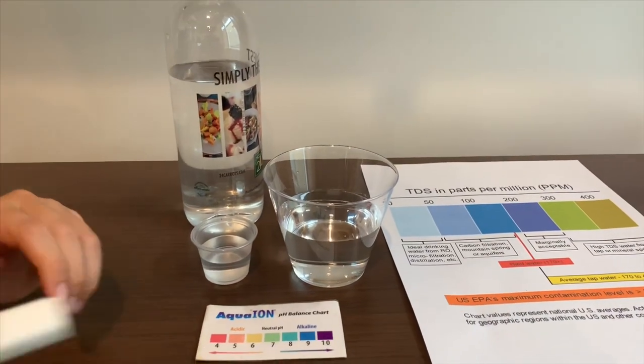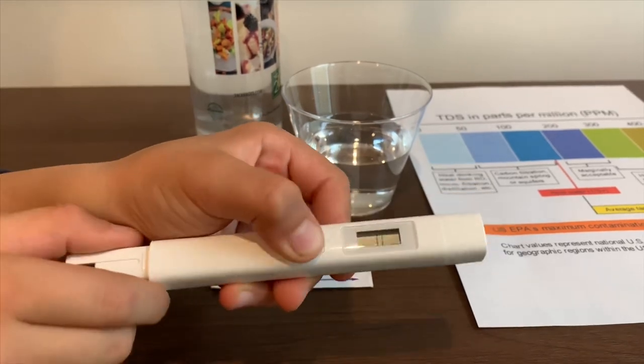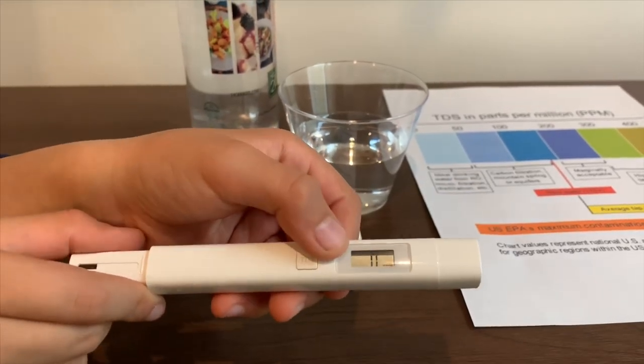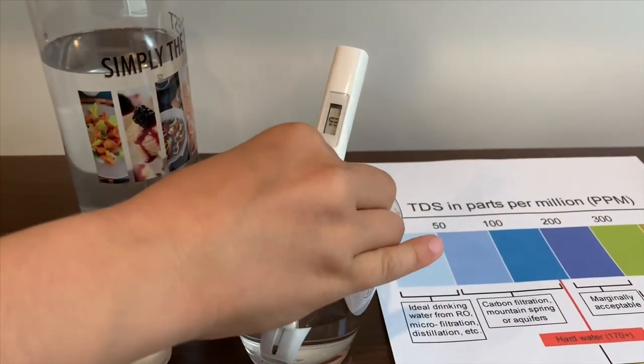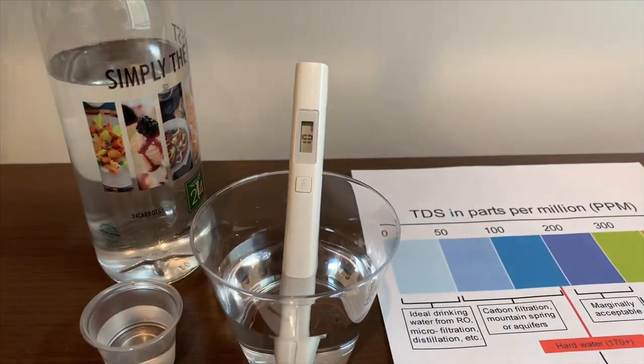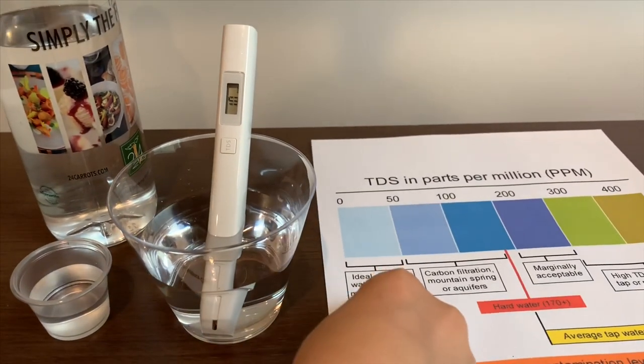If you want to buy this TDS tester, check the link down below. Turn on the TDS tester, make sure it says 0, and put it in — it reads 10. That is ideal drinking water.